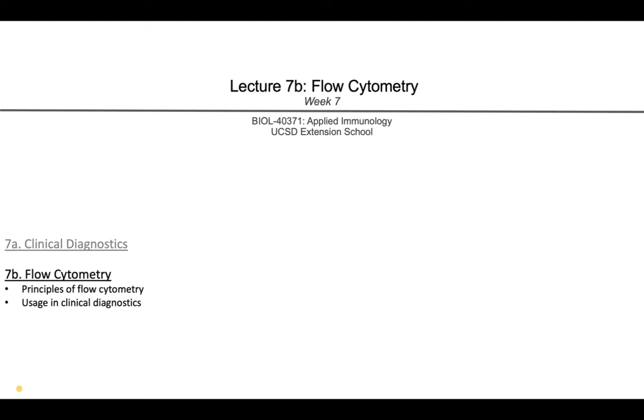Today's lecture will focus entirely on flow cytometry, which we've introduced briefly a couple of times before this lecture. This is a very powerful tool that is used to analyze both basic research and clinical patient samples. Today we will discuss the experimental principles of flow cytometry so that you all have a solid understanding of how these assays work. And then at the end of lecture, we will go over a few examples of flow data used to diagnose different types of diseases.